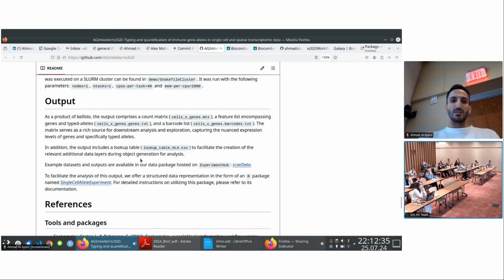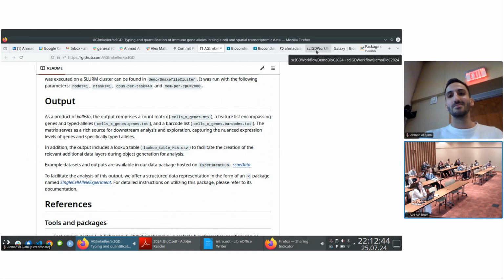So let's say we run scIGD. Now we have those 4 files. So what are we going to do with them? We're going to jump now into the demo, to the code.